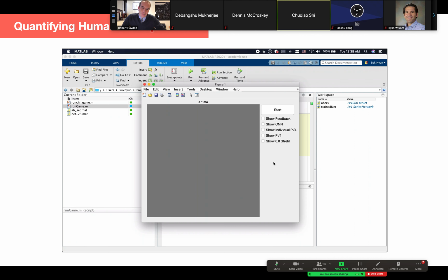To test the performance of the neural network, we really want to compare it against human performance.